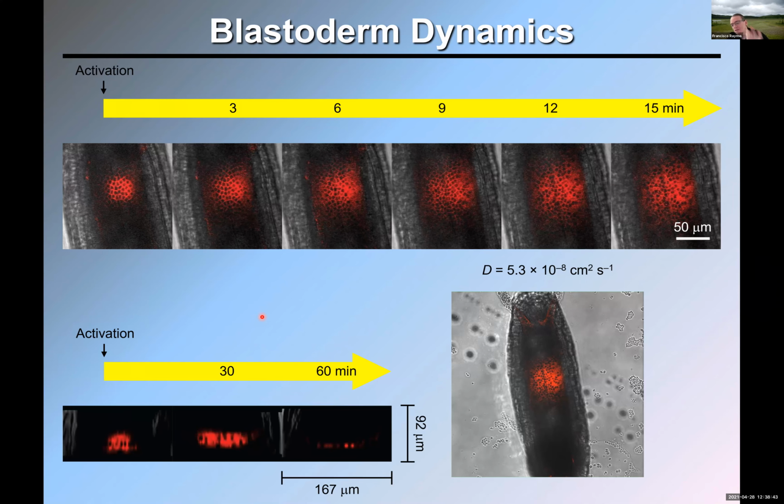Okay, so this is just to show you how the confocal microscope can be used to gain information in 3 dimensions and not just in a single plane. And I think this was my last slide.